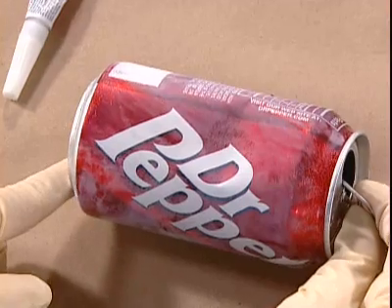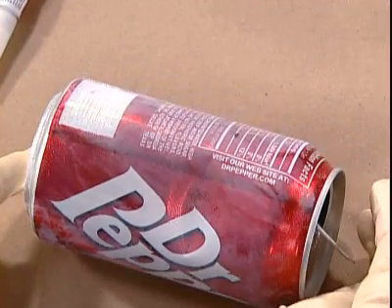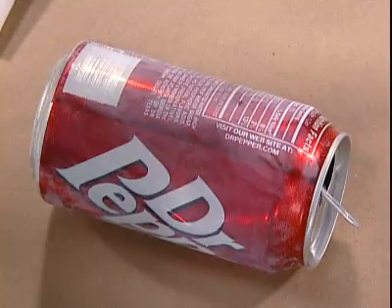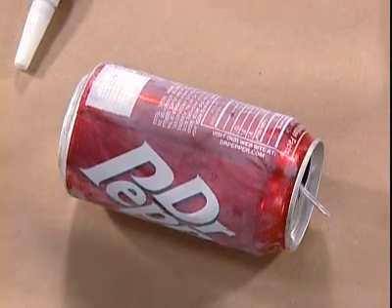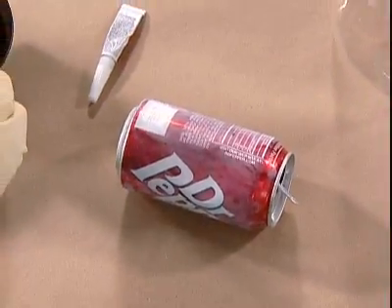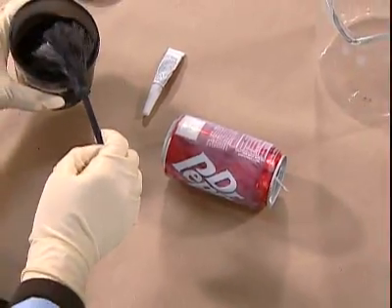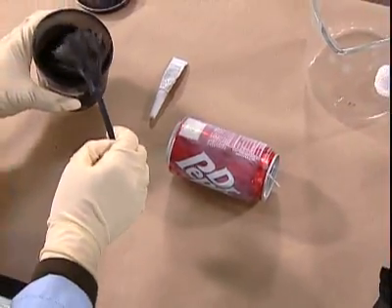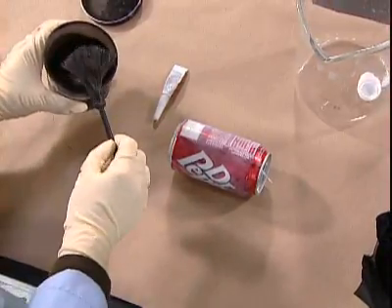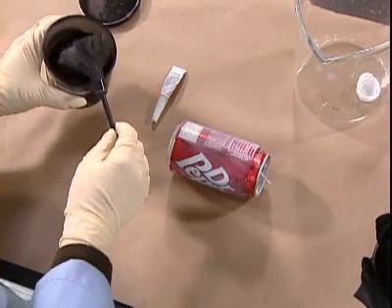So remembering that this is a combination method, what we're going to do now is process it with the black powder. So I have this very finely divided black powder. It's almost like the same material that they make pencil leads out of. It's a graphite, but it's just been crushed into really, really small pieces. So if I sneeze, it's probably because it's gone up my nose.